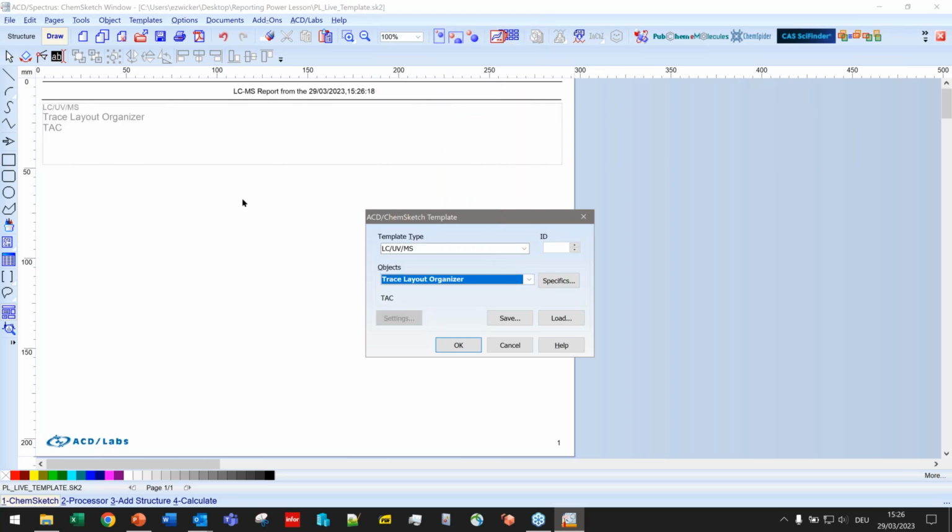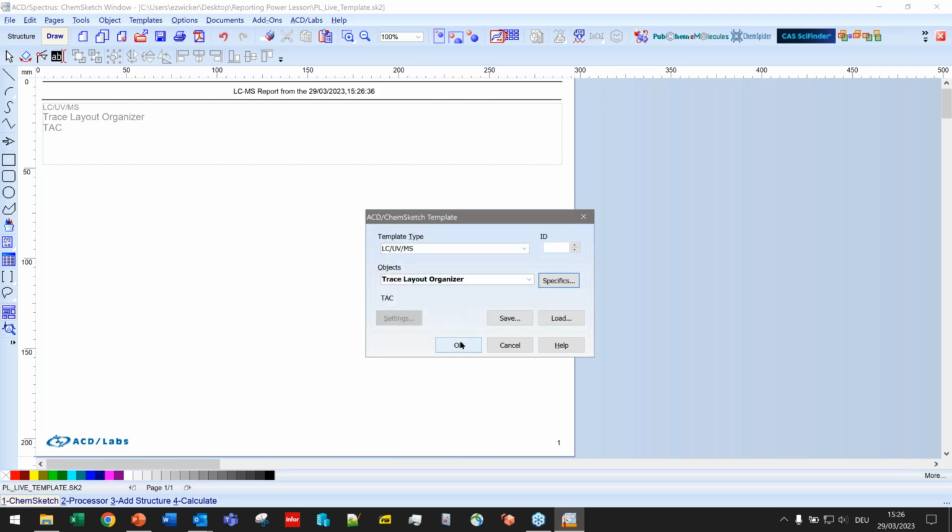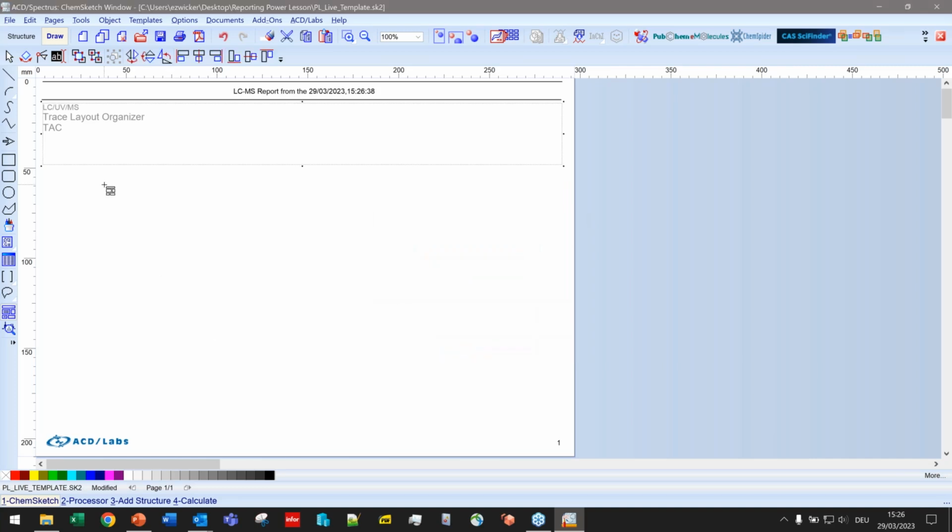And you can see that here in the background, it's referring to the TAC at the moment. And that's what you can change under specifics. So for now, I'm happy with TAC because that's what I want to report. And I'll say OK and OK again.